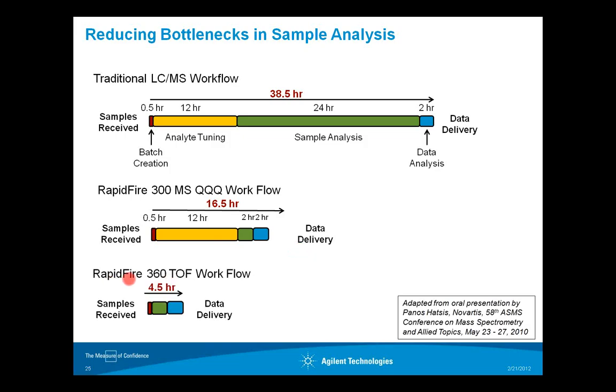Then this group incorporated the TOF system, the RapidFire 360, which integrates with the time-of-flight system. This enables a workflow where a generic method can be used such that analyte tuning is not necessary for each particular compound. In this case, this laboratory now receives their samples on Monday morning. By Monday afternoon, they're able to deliver the data back to the medicinal chemist for the next round.